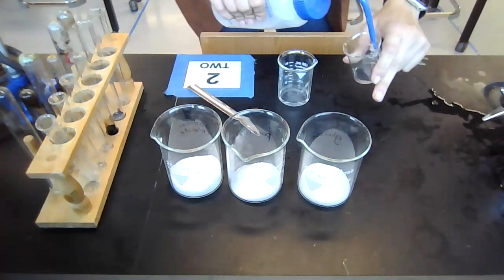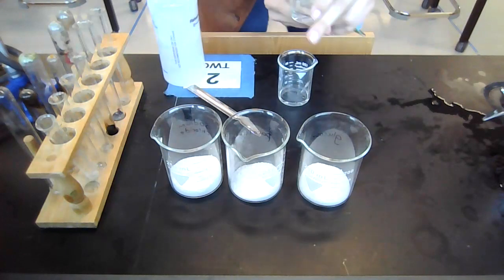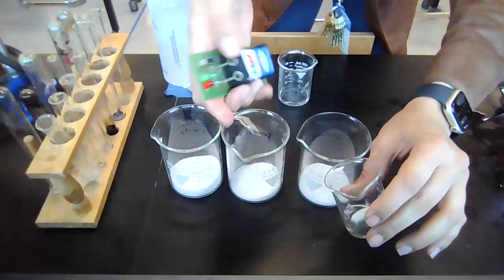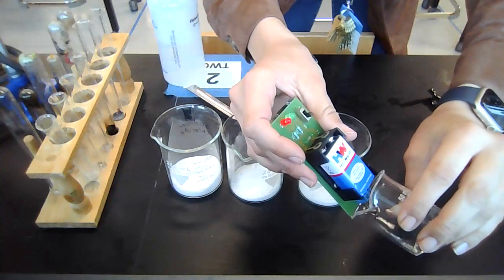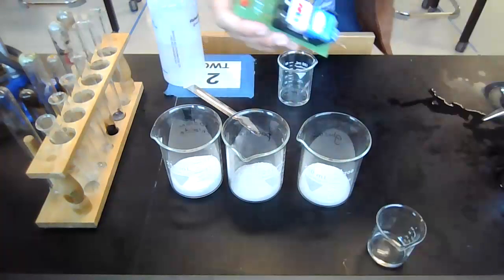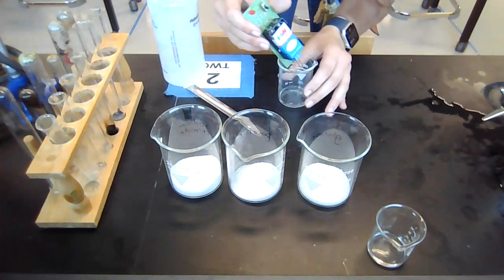I'm going to add some deionized water into an empty beaker here. You can test the conductivity of just regular water. I'm going to turn this on. And you can see just that red light turns on just a little. It's dim, but not much at all. So that's kind of our baseline. Basically, if it's dim, it's not conductive, but if it's bright, then it is.